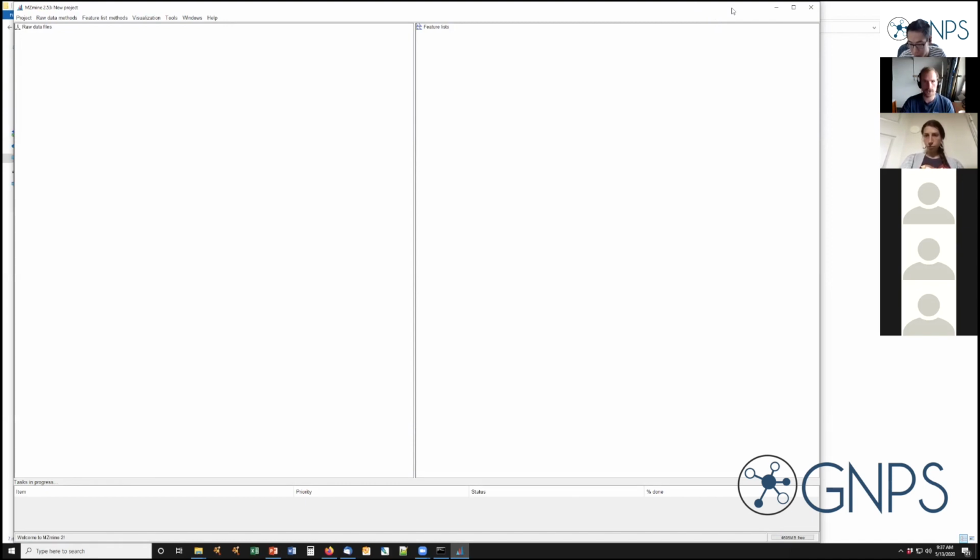That makes computational processing of that information way easier because it's less heavy, so files are considerably smaller. That's one way to directly see whether a file is centroid or profile: when the file size is pretty big. And there's a good link in the group chat that Laura Sanchez posted to illustrate the difference visually. It's useful. Thanks, Laura.